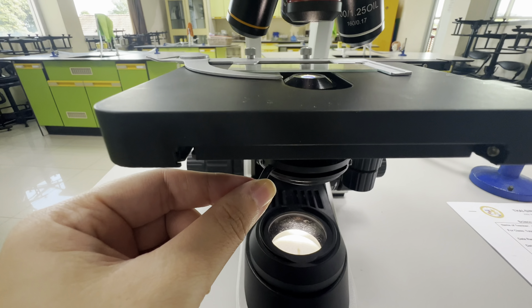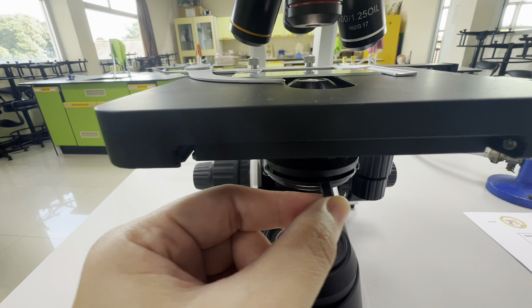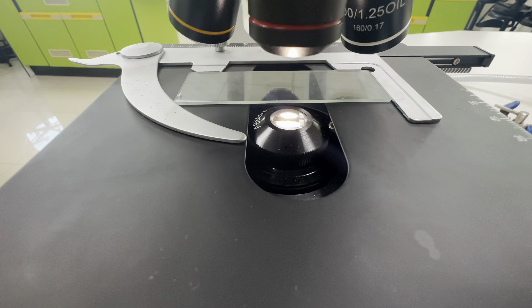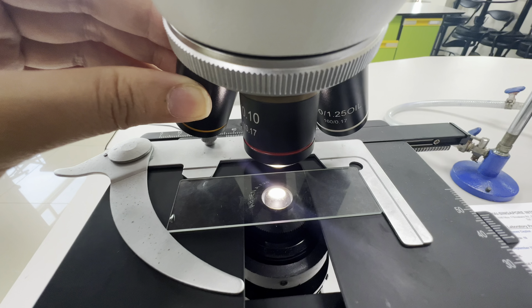This one is the diaphragm. It controls the amount of light that passes through the specimen. There is no set rule on which setting to use for every magnification — the degree of contrast that you desire depends on the transparency of the specimen.